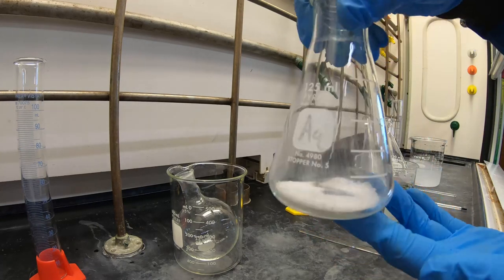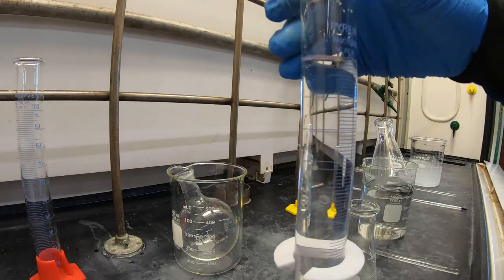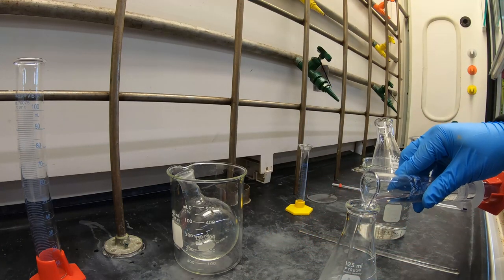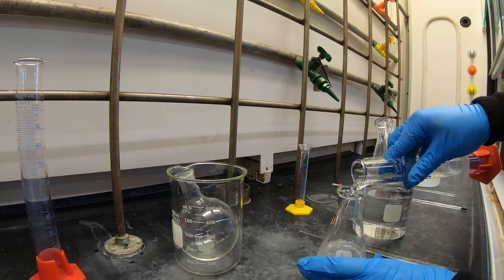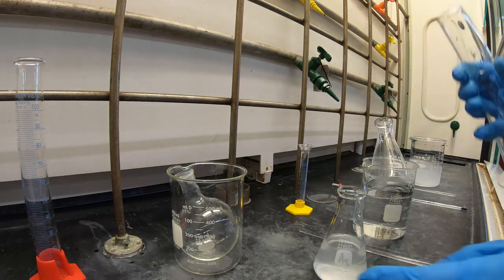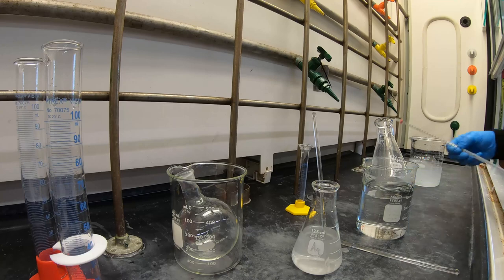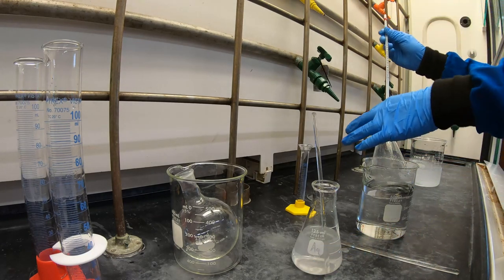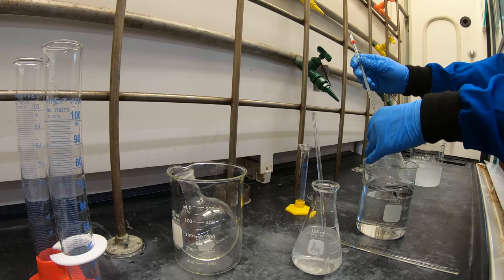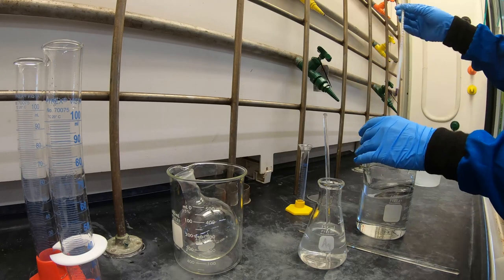While that solution is warming, place 5 grams of sodium acetate trihydrate in a clean Erlenmeyer flask. Dissolve this using 100 mL of deionized water. Now check the temperature of the flask in the hot water bath. Once it has reached the desired temperature, remove it from the bath and place on the bench.